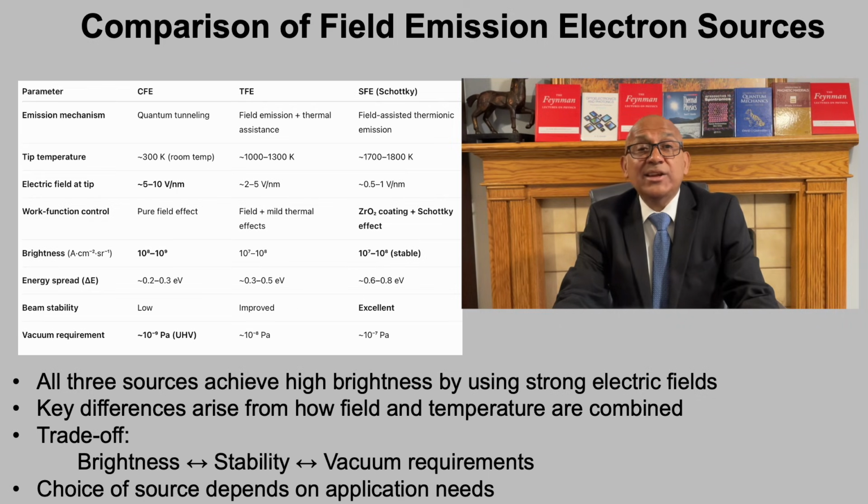Overall, this comparison highlights an important trade-off. CFE maximizes brightness, TFE balances brightness and stability, and Schottky sources prioritize robustness and reliability while still maintaining high performance.